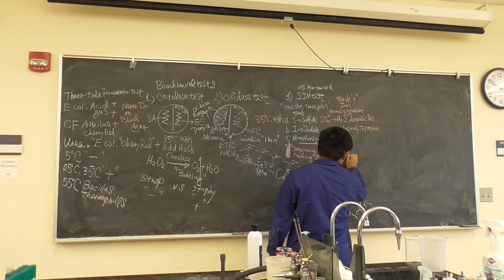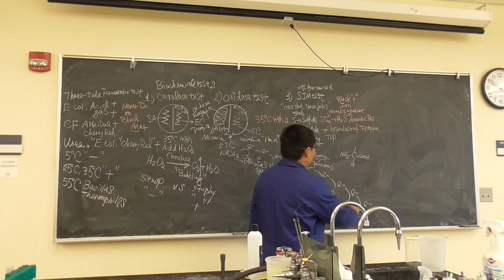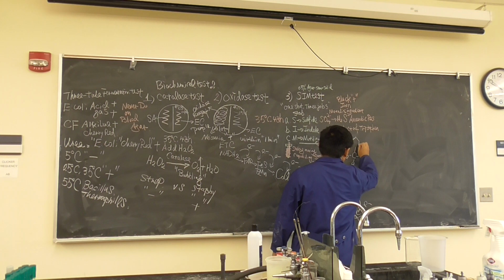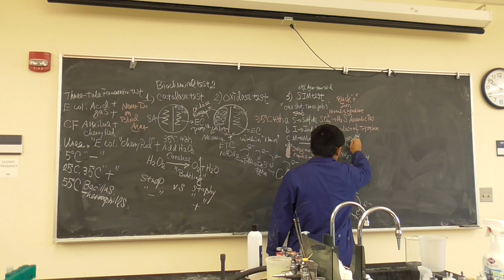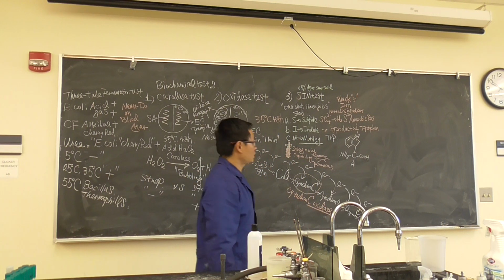Do you still remember amino acid structure? You can't forget about it, okay? What do you have? Is that right? Tryptophan.